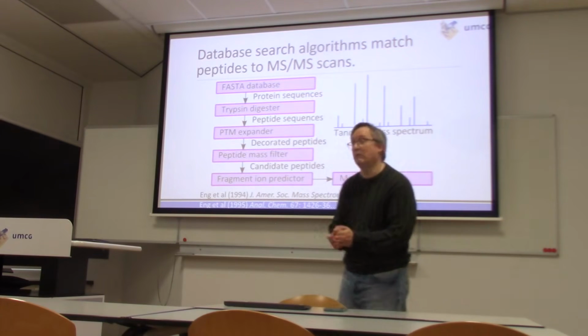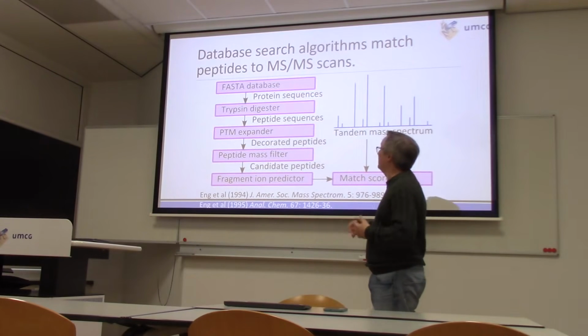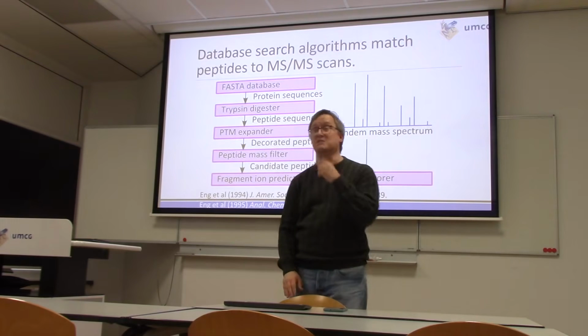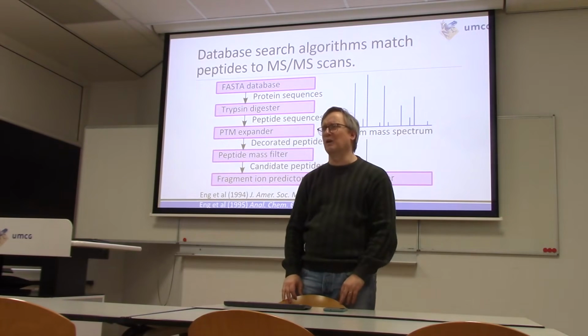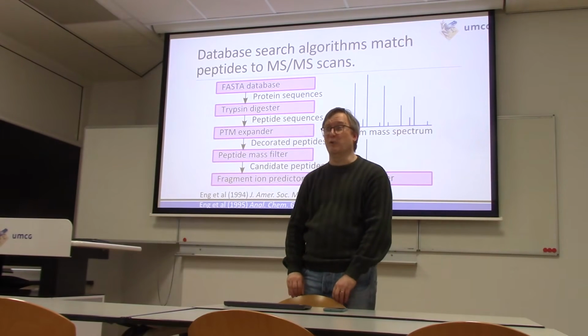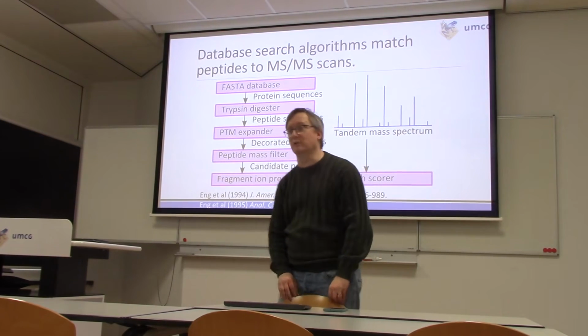That works pretty well. In fact, a lot of search engines will download it for you, so they can make your life rather simple in that way. How many proteins might we expect for a given species? Well, it's wildly variable. If you're dealing with something like E. coli, there are only about 4,400 protein coding genes. If you download yeast, you're going to get about 6,200.